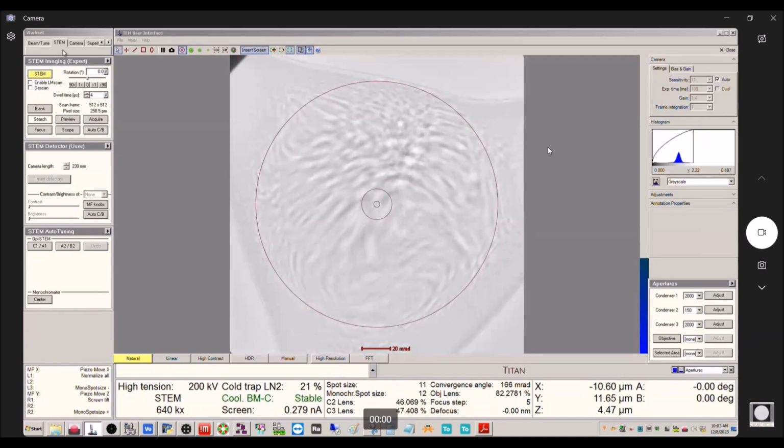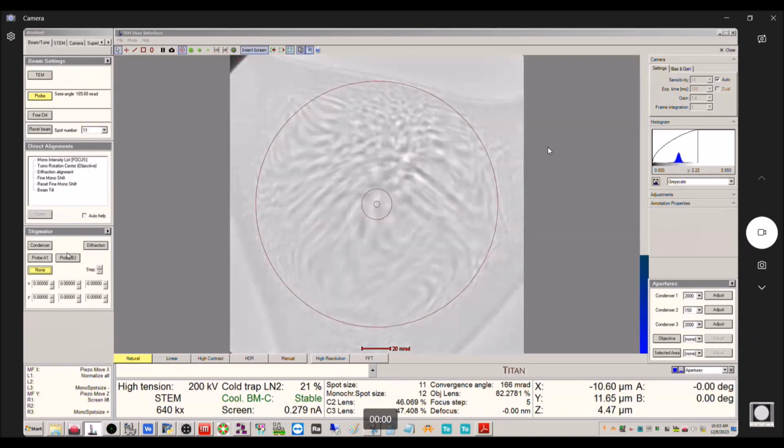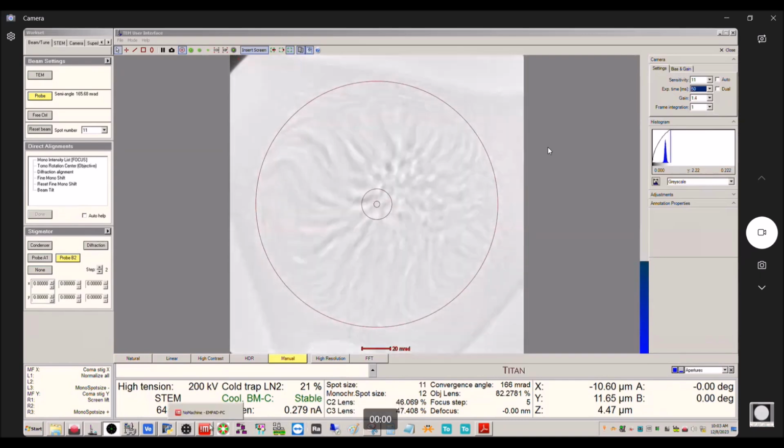Okay, so it looks like pretty obviously here we've got quite a bit of B2, right? So if you go back and forth here, bump this down here. Right, so we can see pretty obviously there.